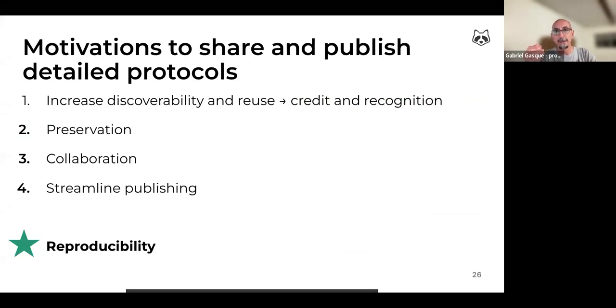And as a bonus, by practicing open science and particularly open methods, you will increase reproducibility.